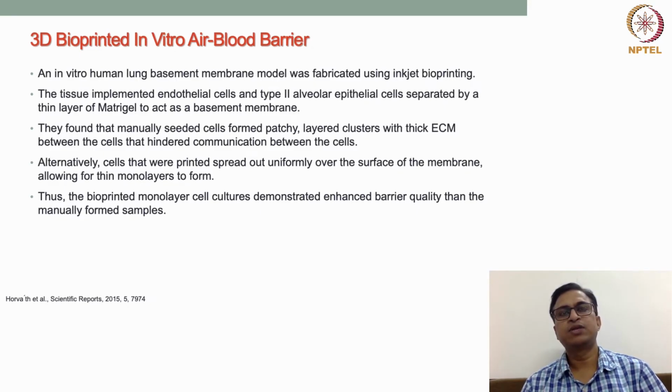that this technology works on the principle of generating droplets. These droplets can be patterned on a substrate or a supporting structure, and cells or any other bioactive molecules can be incorporated within the bioink, where a water-like viscous material like cell culture media or buffer can be used.